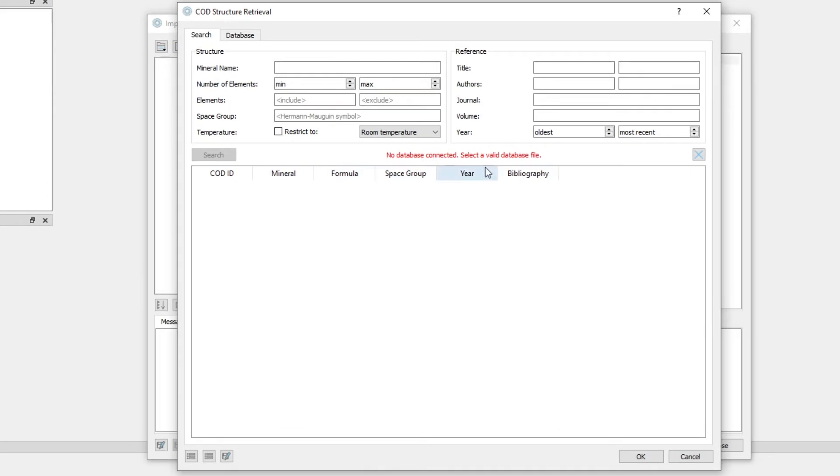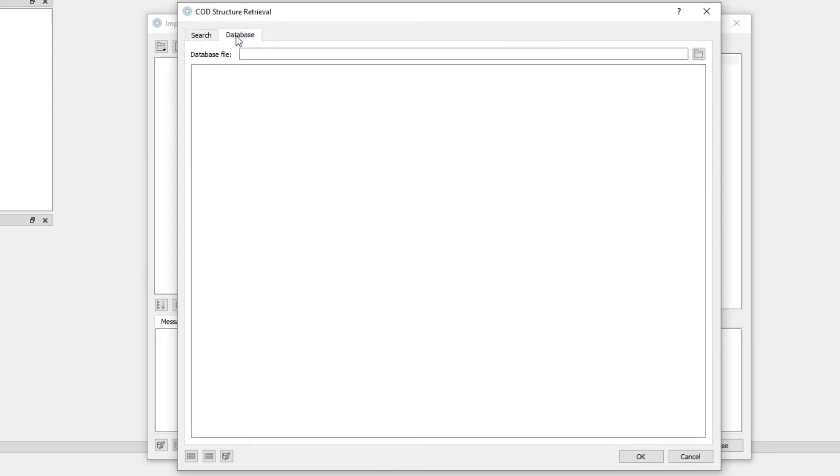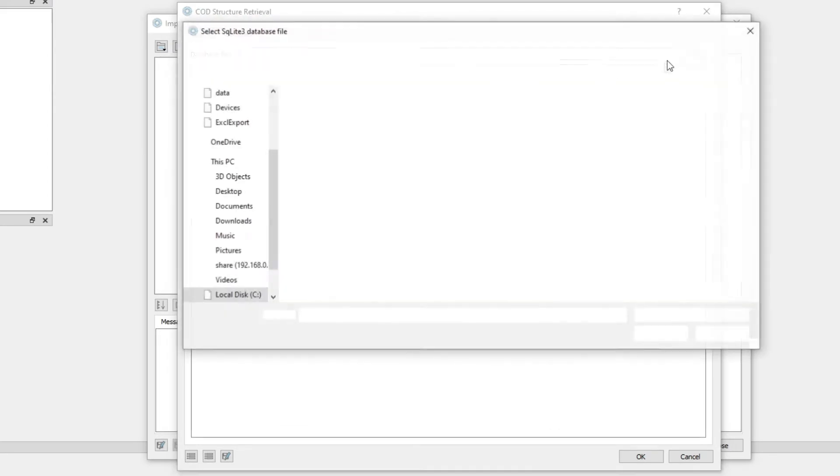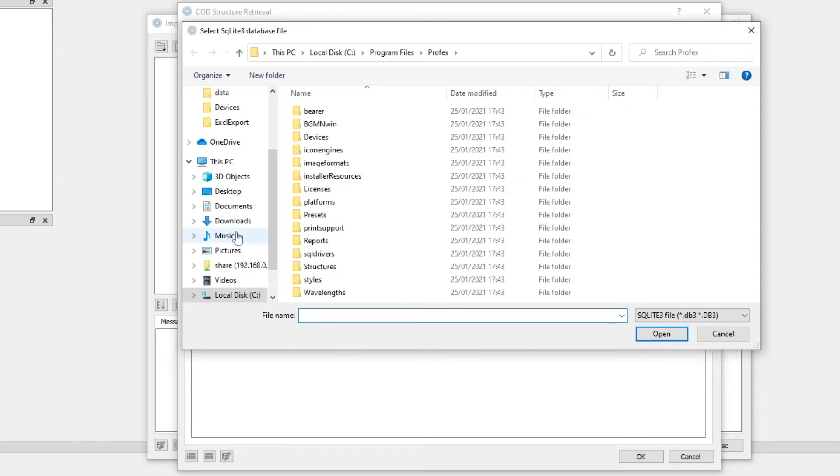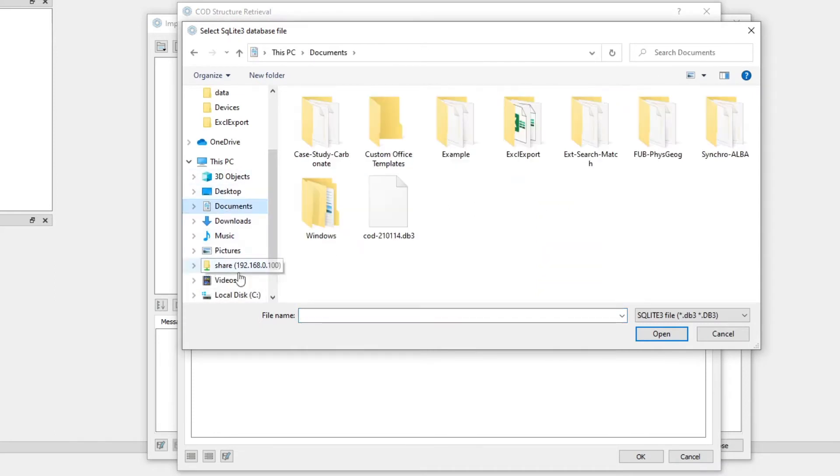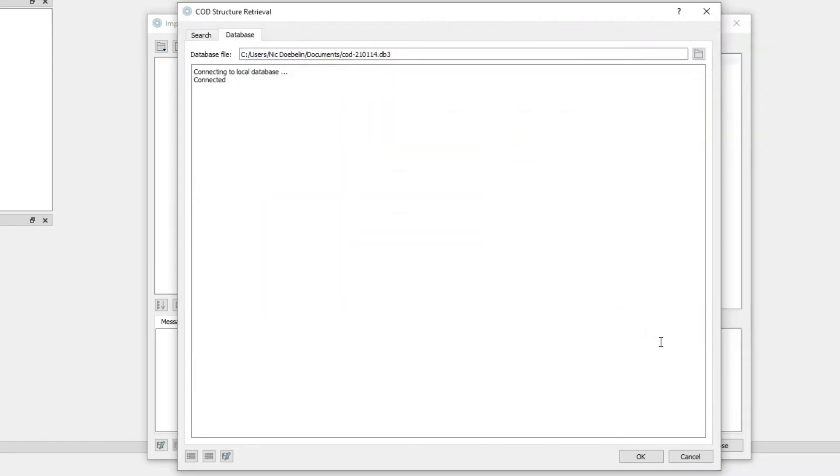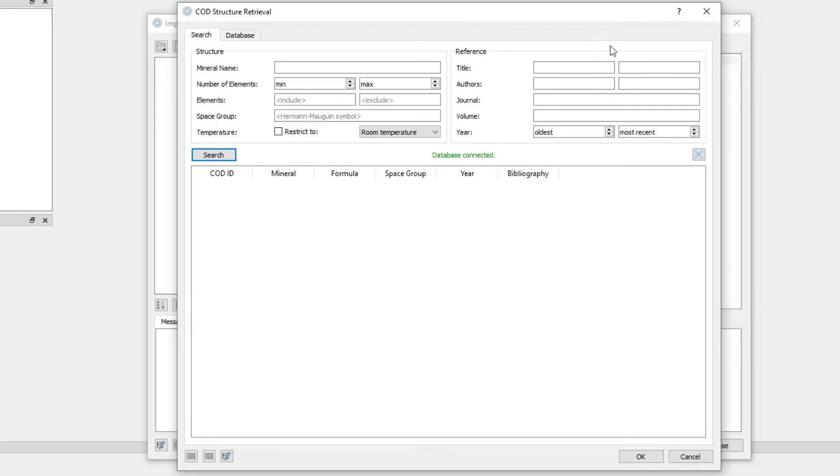And to do that, we go to the second page, Database. And we open the file we just downloaded and copied to our documents folder, the COD file. Now it says connected. We go back to the search page and database connected.